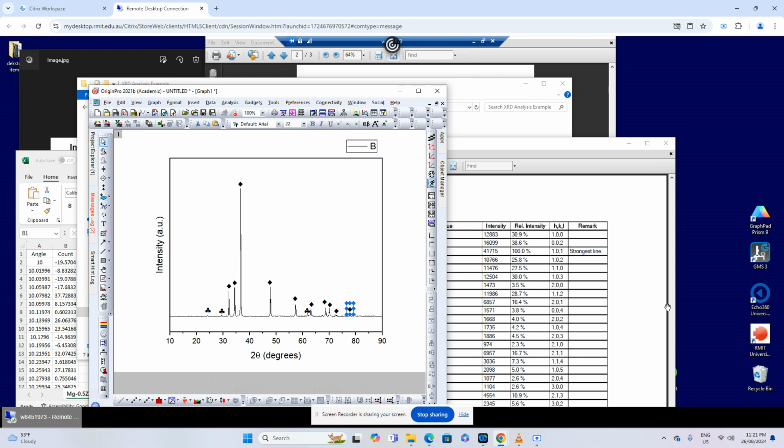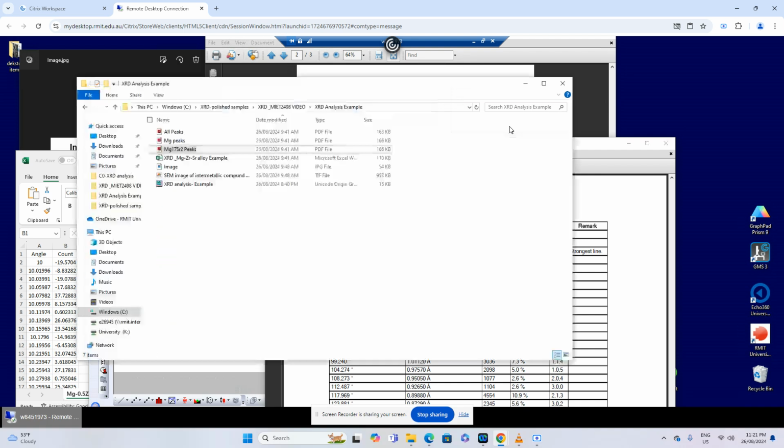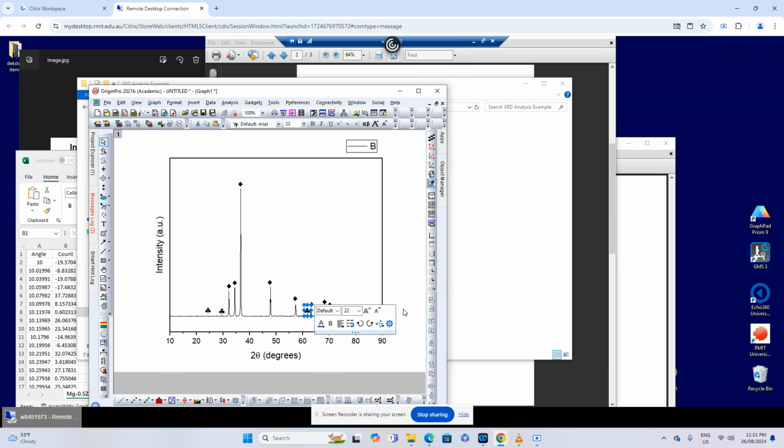If you do not find this one in magnesium, then look at the other compound, the other PDF that we have generated for the other phase. So we make sure that all the peaks are indexed. Then we have a peak at 79.64. So we look at the other one. So 79.4 is from the other phase, which is the magnesium 17 strontium compound. So we just copy this one here and put it here.